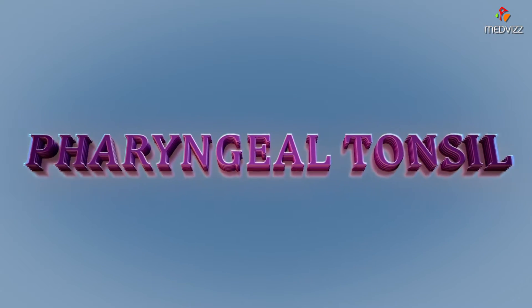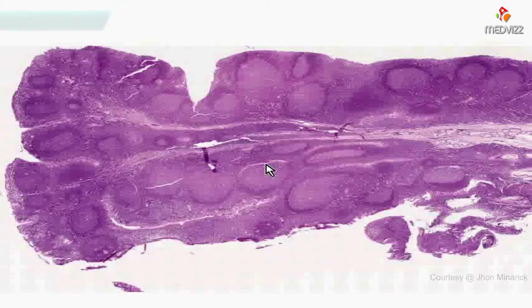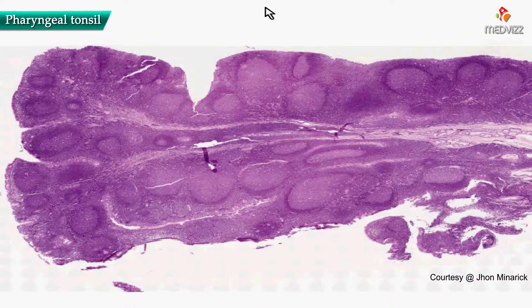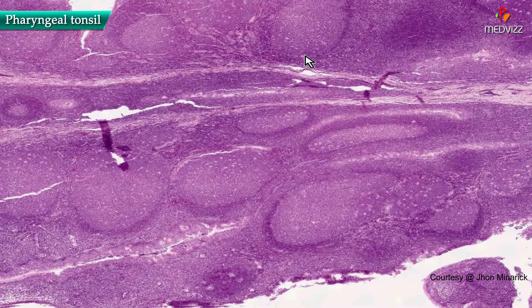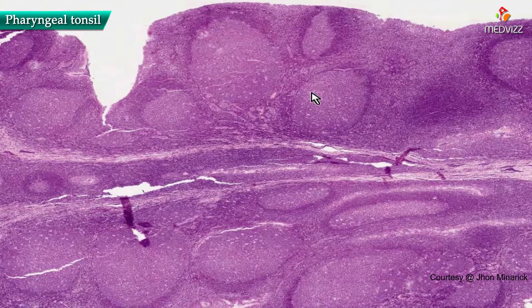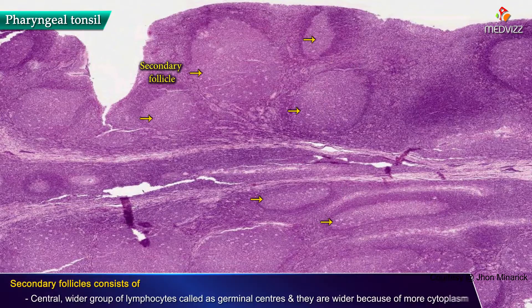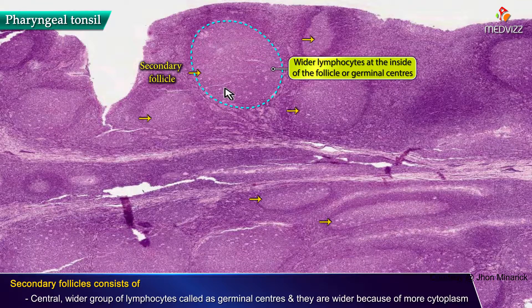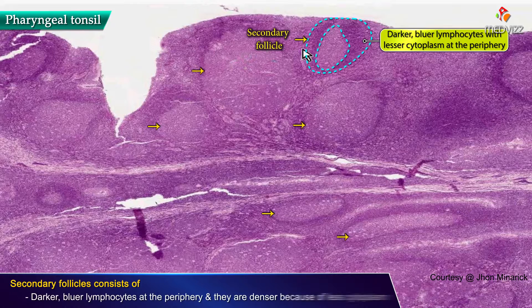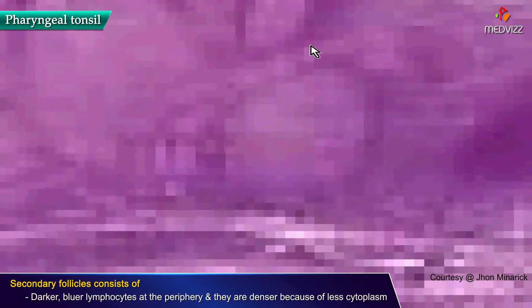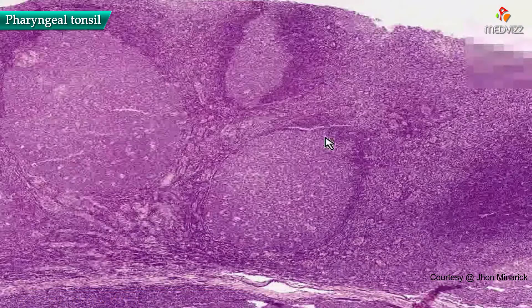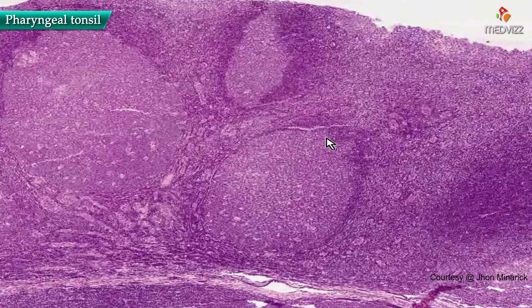This is a pharyngeal tonsil. Here is another obvious lymphoid tissue or perhaps lymphoid organ, in which you can see, like in practically all lymphoid organs, follicles or secondary follicles. In these, you have the clearer or lighter lymphocytes on the inside of the follicle or the germinal center, and then the darker, bluer, or less cytoplasm cells towards the periphery of the follicle. So we know that this is some type of lymphoid tissue.